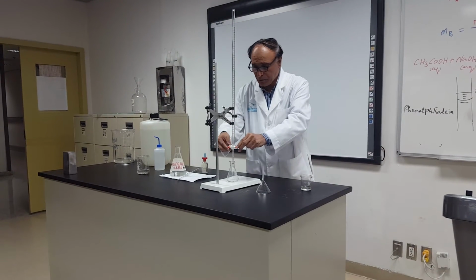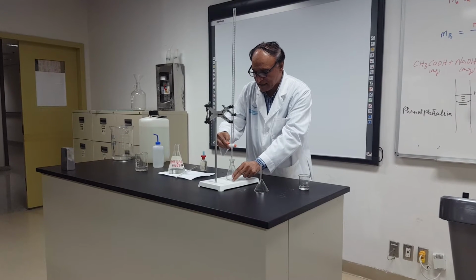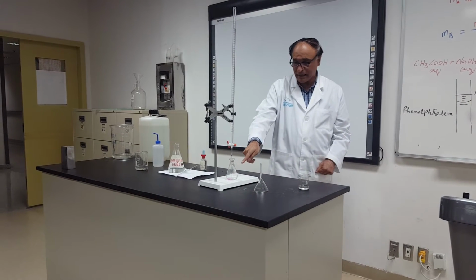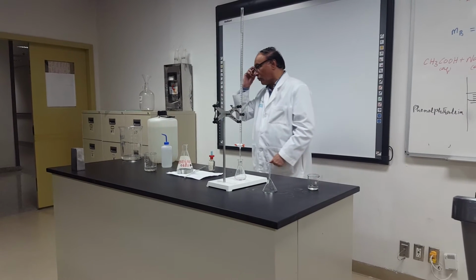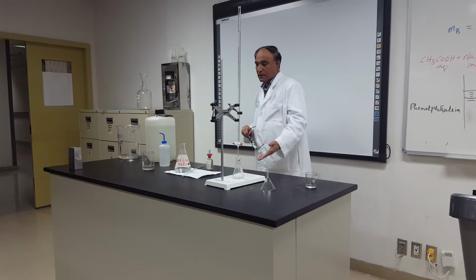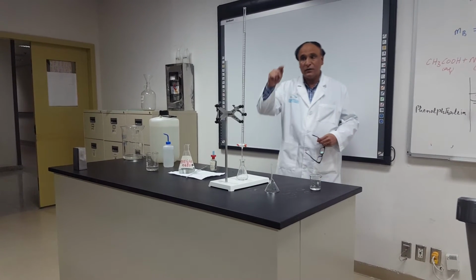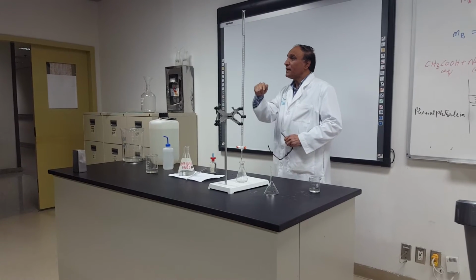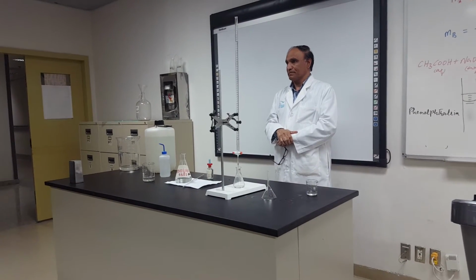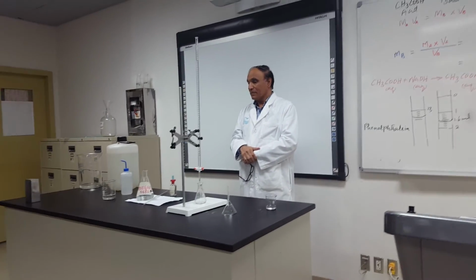If I put this one, look over here. If I put this one, see, there is a change. You can see the pink color? Yes. This pink color, it will come and it will go. As you shake, it will go. We want to put it up to that level when the pink color does not go. And we have to be very careful in that.